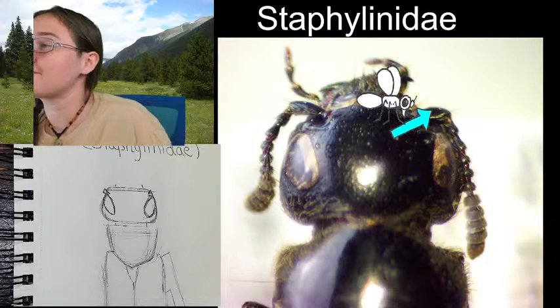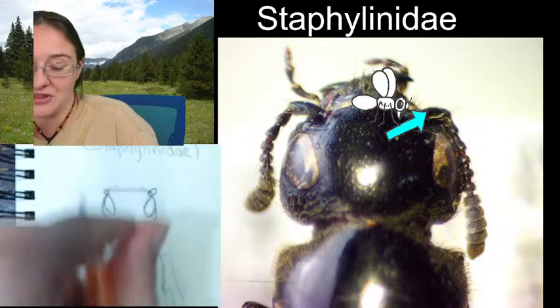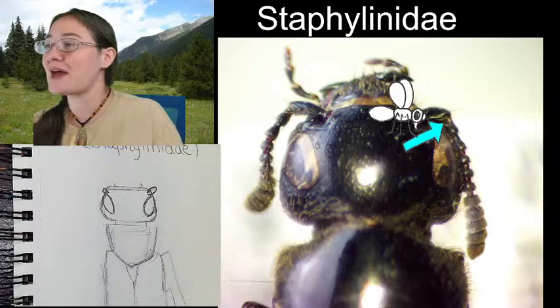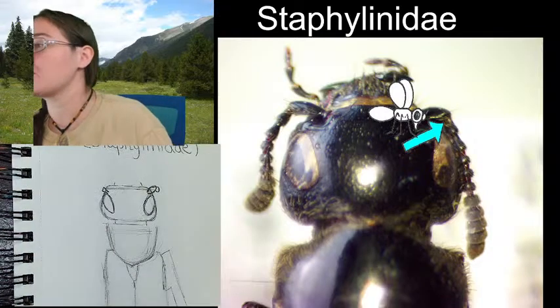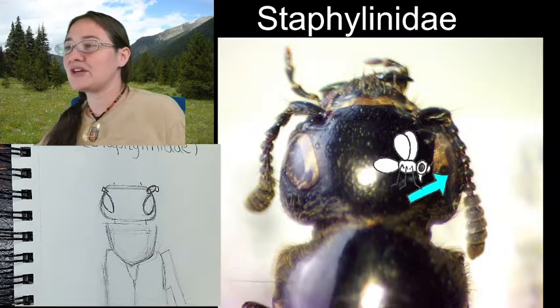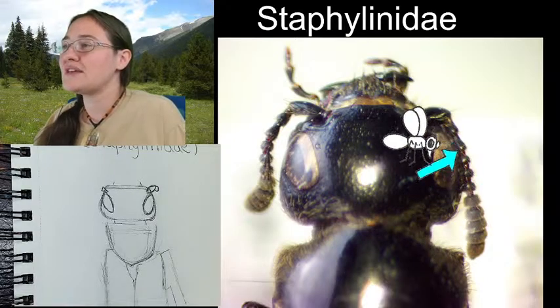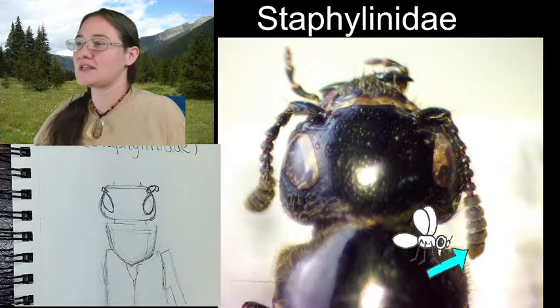Now we know that the first segment of the antenna has its own special name, called the scape, even though it is considered a segment on the antenna. So if you ever hear someone say an insect has 7 segmented antennae, that includes the scape and the pedicel, which is the next little segment that has its own name. After that, you have the rest of these segments that we call the flagellum, and these are generally going to be very similar in shape, unless the specific kind of antenna calls for it otherwise. Like this right here, all of these segments are very similar, and then you get to the end, and this is a clubbed antenna. So these segments make up your club.